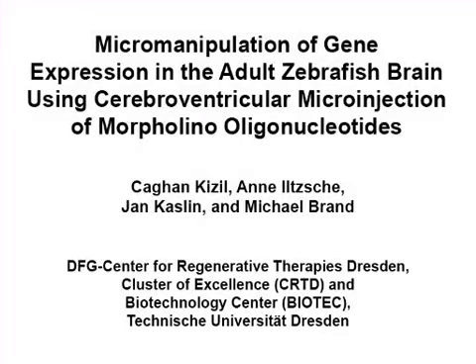The overall goal of this procedure is to microinject morpholino oligonucleotides into the cerebral ventricle of the adult zebrafish brain and to knock down the activity of genes in the radial glial cells.